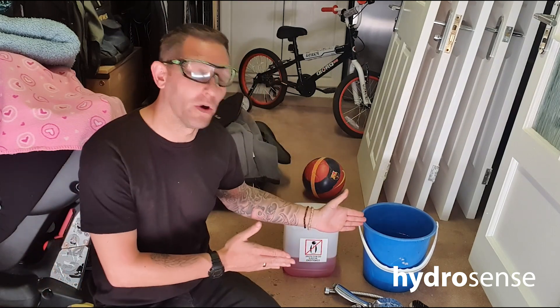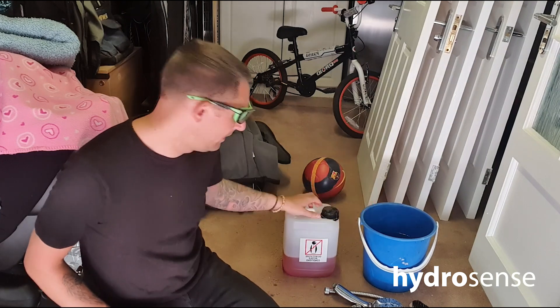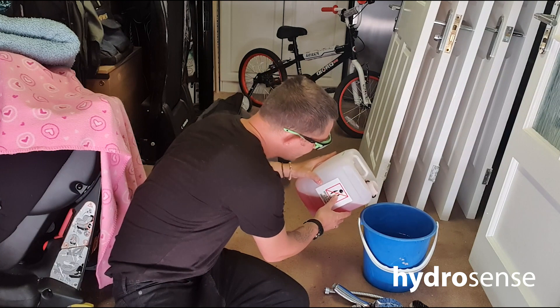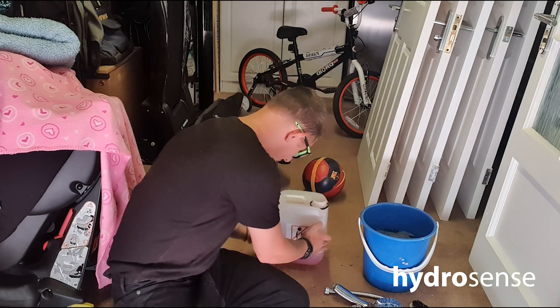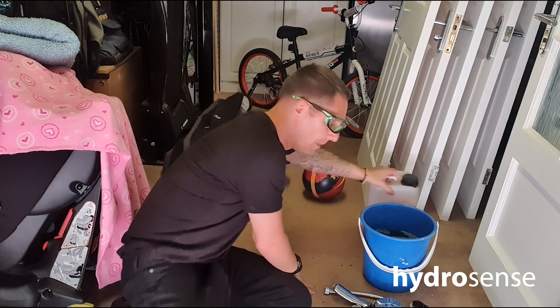So we have a bucket of water and we need to dilute some of the chemical in the water. I'll add the shower cleaning chemical in there — I think that should do it. And we put that somewhere safe.